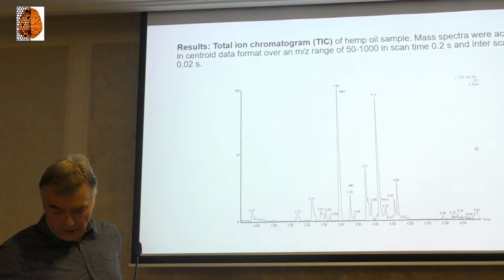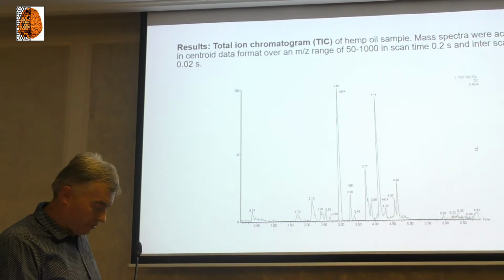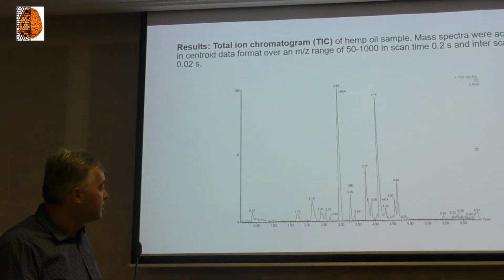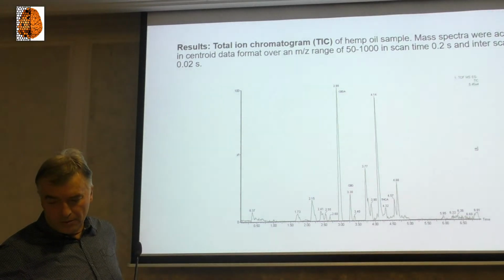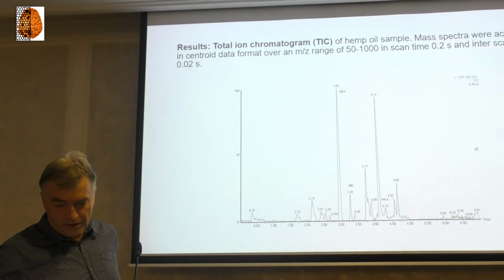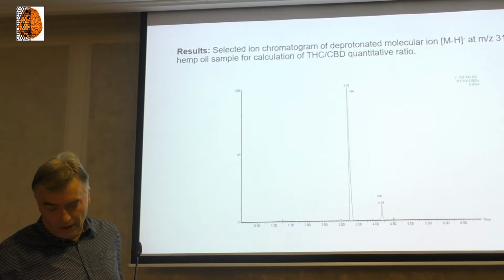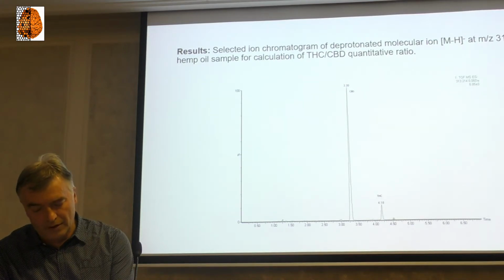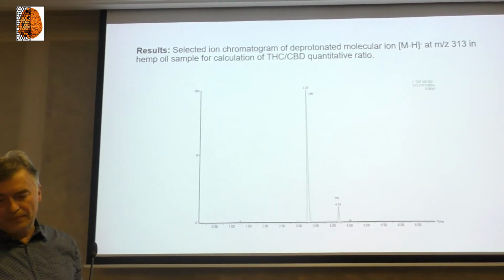These compounds are also measured and described with high-resolution mass spectrometric measurements. But first, we would like to see our molecular masses of THC and CBD.